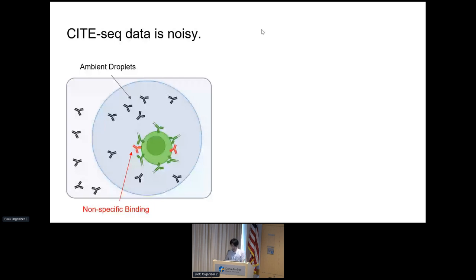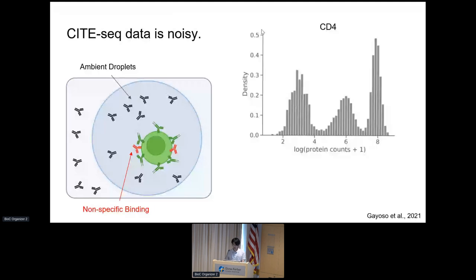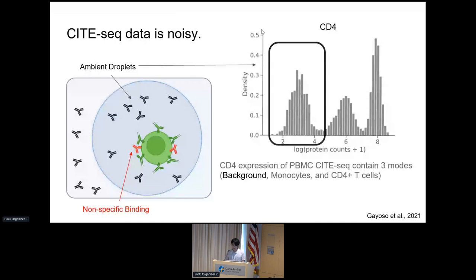The primary focus of ongoing research involves addressing the removal of background noise in CiteSeq data. Because CiteSeq is an antibody-based technique, it introduces substantial noise into the data. Consider a scenario where CD4 expression is plotted into a density plot in CiteSeq data—we get a trimodal distribution where the first peak does not necessarily represent real cells such as monocytes or T cells, which appear on the second and third peaks. This highlights the need for effective strategies to identify and remove such background noise.